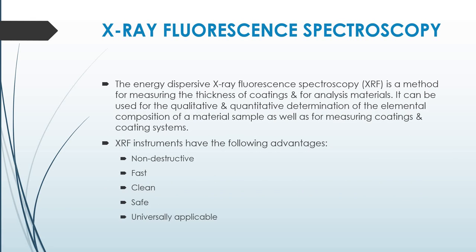Next spectroscopic method is X-ray fluorescence spectroscopy, that is XRF. The energy dispersive X-ray fluorescence spectroscopy is a method for measuring the thickness of coatings and for analyzing materials.